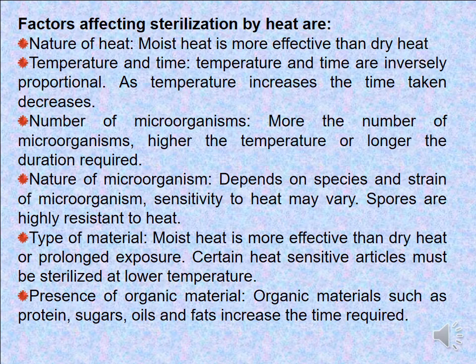The presence of organic material. Organic materials such as protein, sugars, oil, and fat increase the time required.